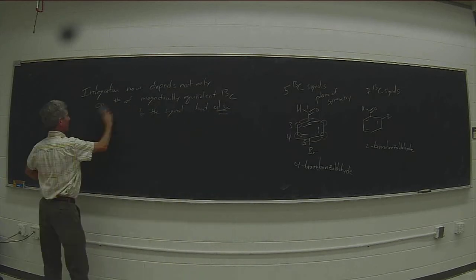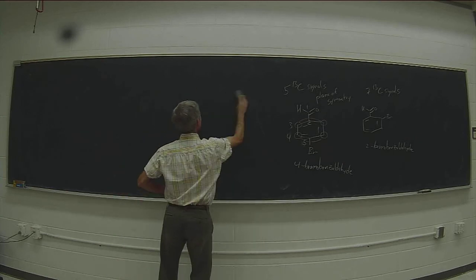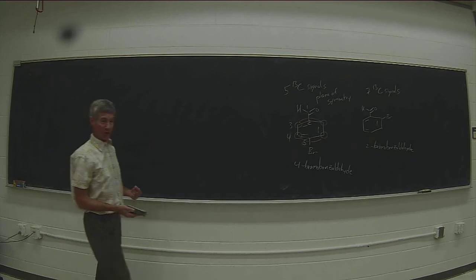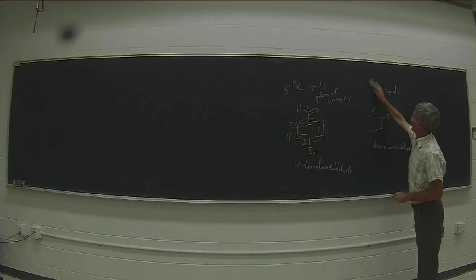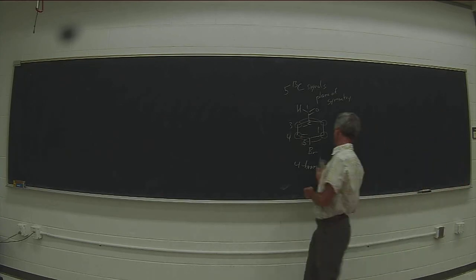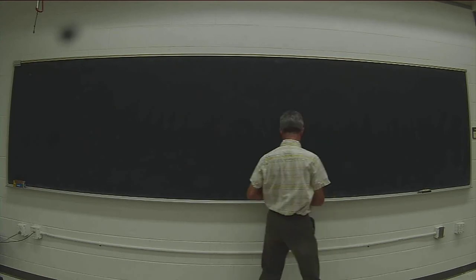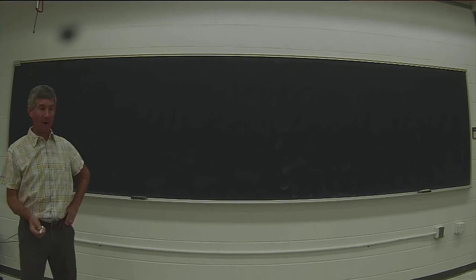Another problem with carbon NMR, of course, is that because we have the nuclear Overhauser enhancement, but we also have the possibility of magnetically equivalent carbons, we can't necessarily tell from the carbon NMR directly whether we're looking at a CH3 group or a CH2 group or a CH group. If we ran proton-coupled carbon NMR spectra, we could, but with proton decoupling, we've lost that piece of information.